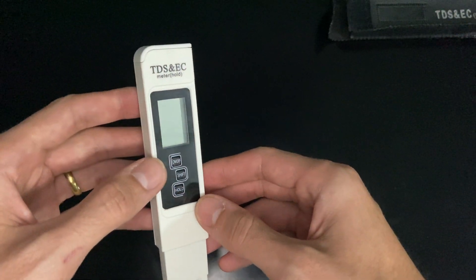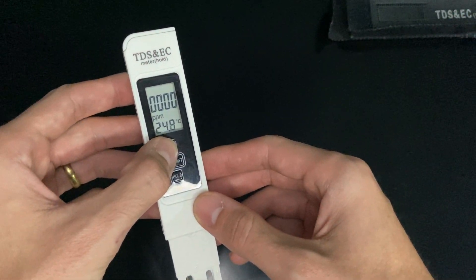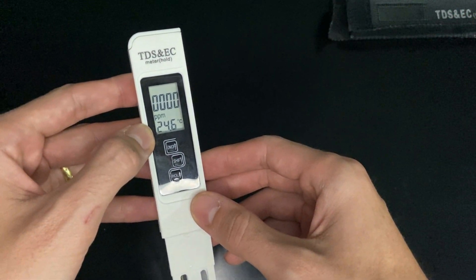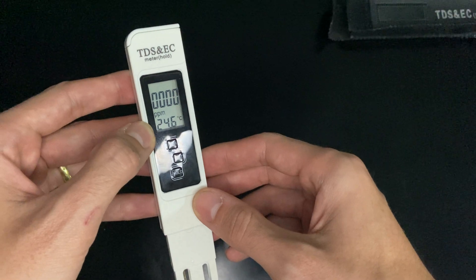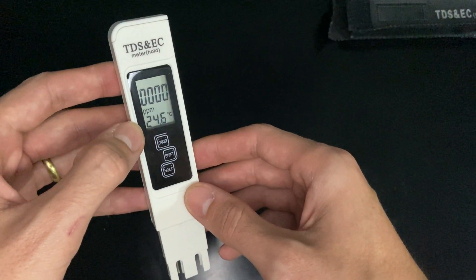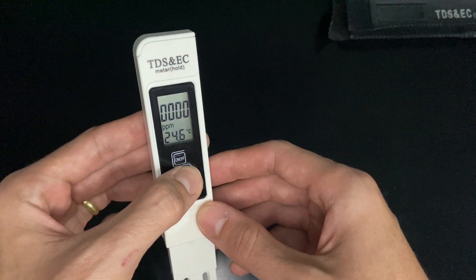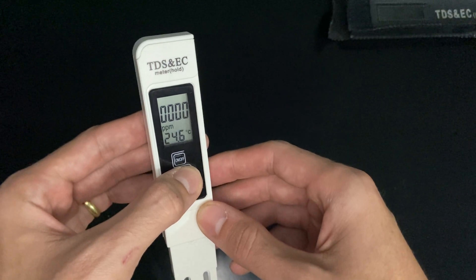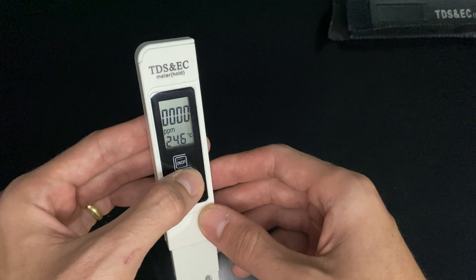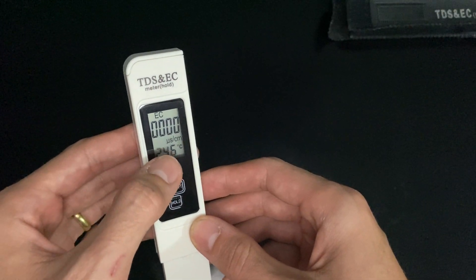Here we have three buttons: on/off. It also measures the temperature of the water and the environment. We have the shift button here because it also measures the electricity in the water, measured by microsiemens units.